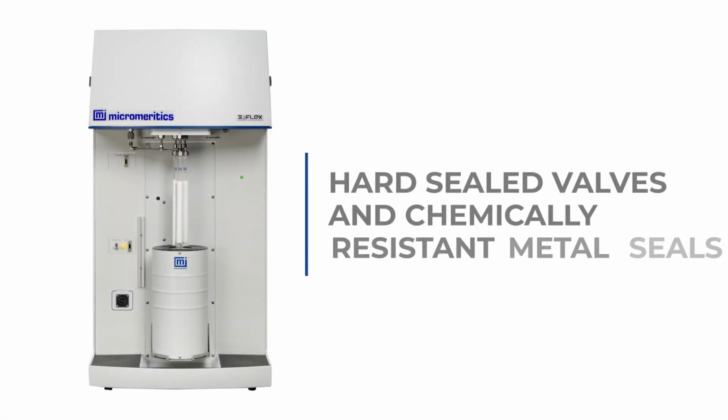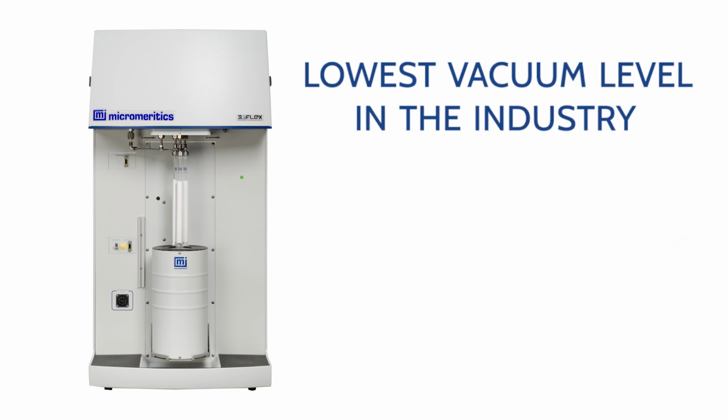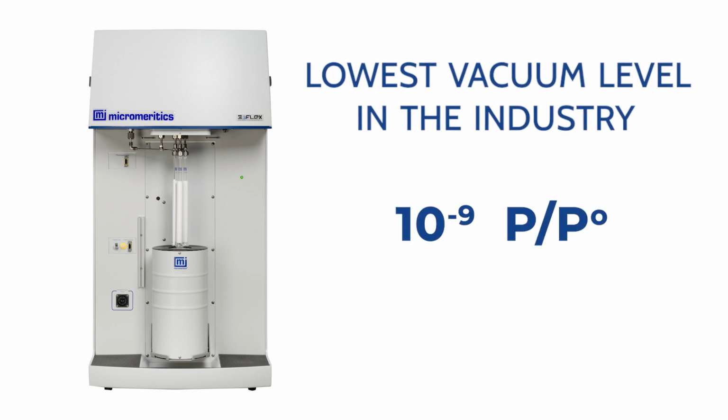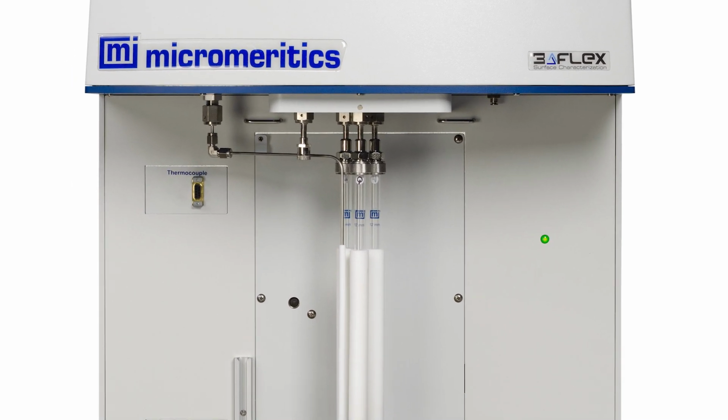The 3Flex is capable of analyzing both physisorption and chemisorption. In this video we're going to be looking at physisorption. The 3Flex features hard seal valves and chemically resistant metal seals that allow for collecting adsorption isotherms starting from 10 to the -9 p/p0. This allows the 3Flex to achieve the lowest vacuum level in the industry. The 3Flex has the greatest precision when determining surface area, pore volume, and pore size distribution.